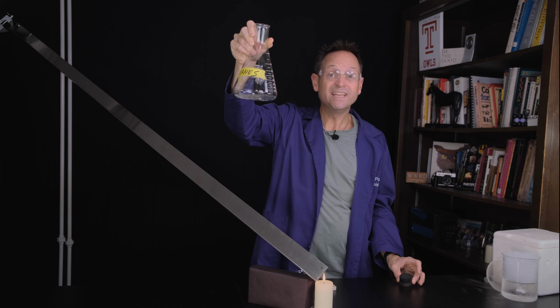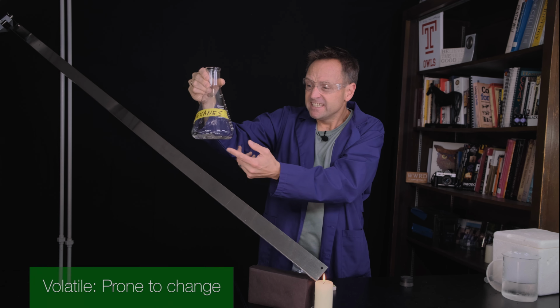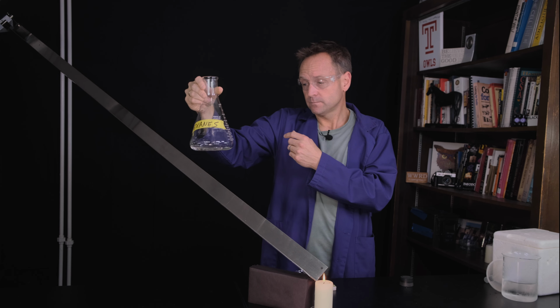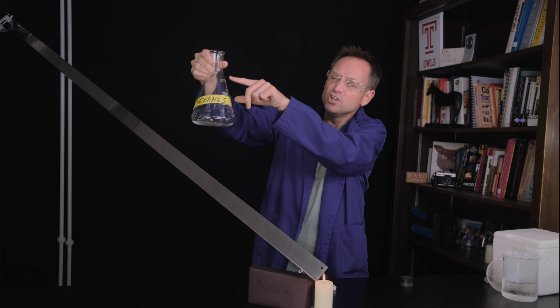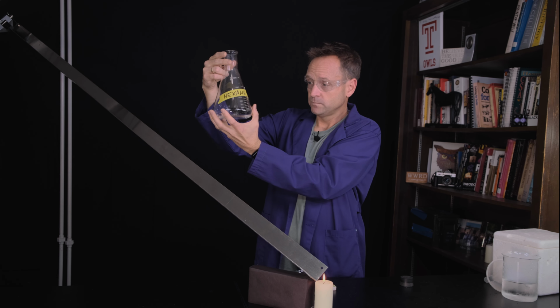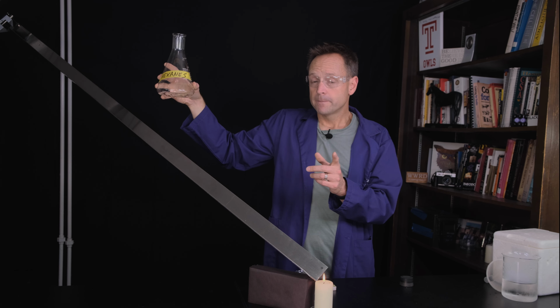we can't see that vapor. How do we even know it's there? It's volatile. Volatile means it's prone to change. It's in its liquid state, but it's really close to becoming a gas state. I can smell this. That's one way that I know it's volatile. I'm going to assume, temporarily, that there's just hexane vapors in here, but we can't see them until you can.